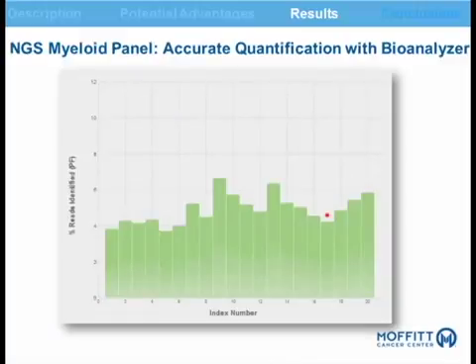Another thing that was nice to see was, and again, all of this data is pulled out of either NextGene or the MiSeq software itself, that even without library quantification, we were able to see a relatively evenly distributed run among the samples, and this brings up how many we multiplexed. In this assay, we multiplexed a total of 20 samples together.